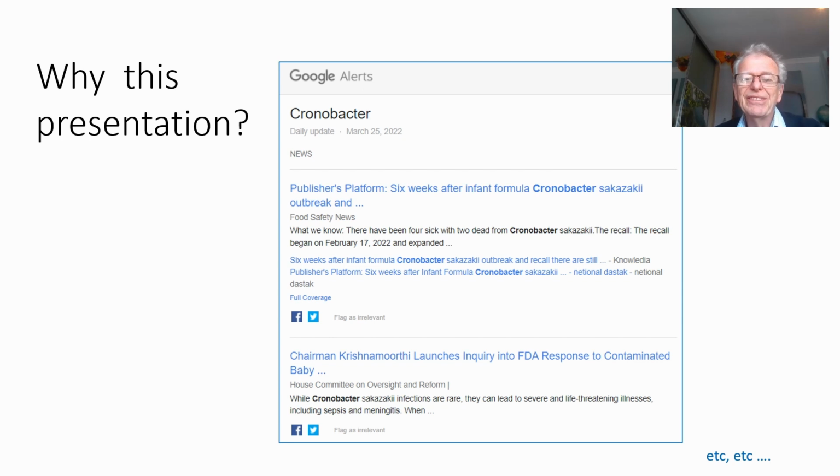Why do this presentation? Well, similar to the last one, currently, you can see the date 25th of March 2022, there's still a lot of social media alerts on Cronobacter and infant formula. A number of questions are going on, and the idea of this presentation is to show you advanced techniques in MLST analysis, but also to put a context as to where one can actually isolate Cronobacter.